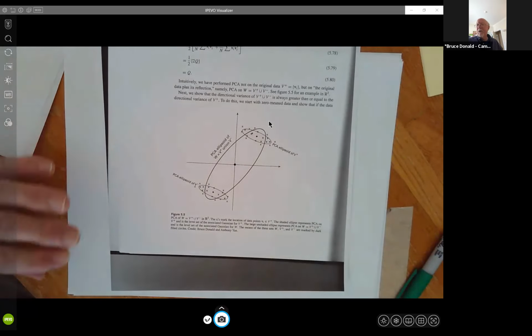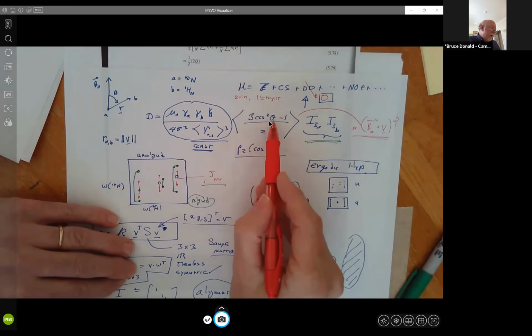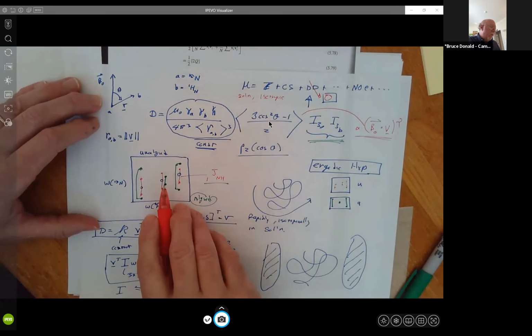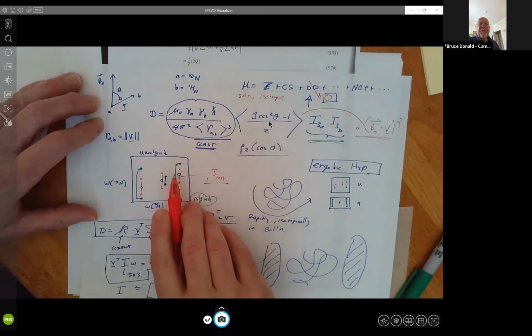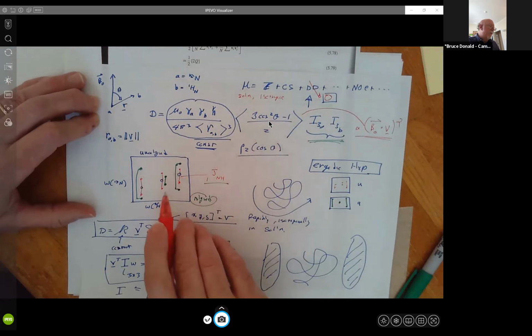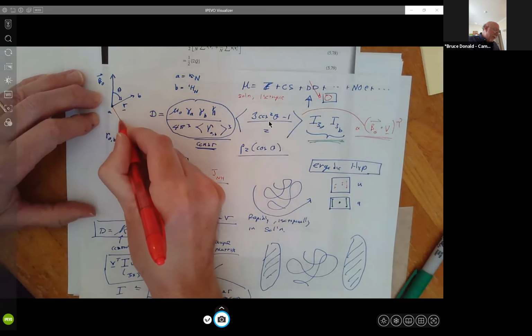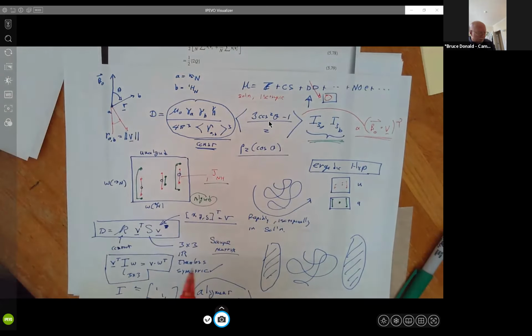One complication, and it comes up a lot in this work, and this is from the textbook, is that if you look at our RDC equation, which I had here, you'll see that you have this cosine squared. And this roughly means that if I have an alignment tensor, or I know B0, and I've measured the RDC, there's basically two solutions. Like in robotics, there's an elbow up and an elbow down solution. So we can't distinguish that solution from this one on that information alone, right?